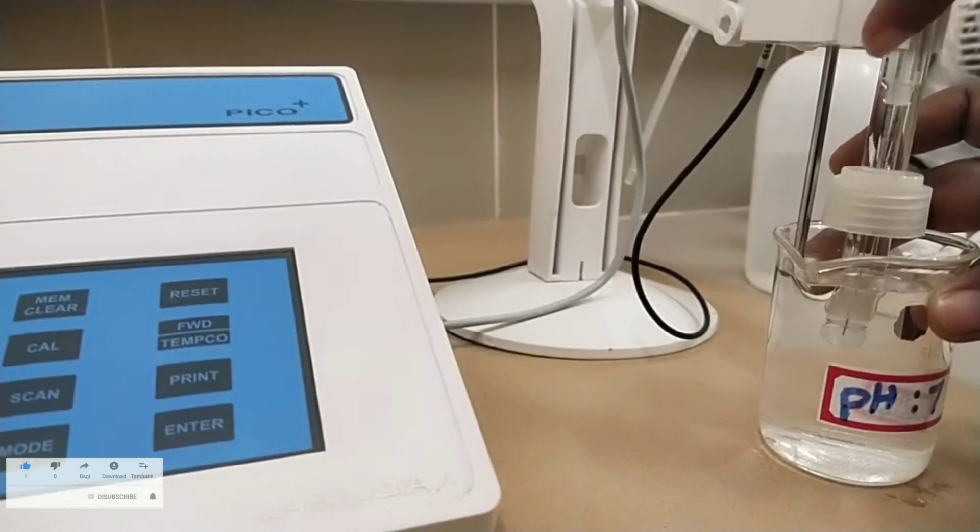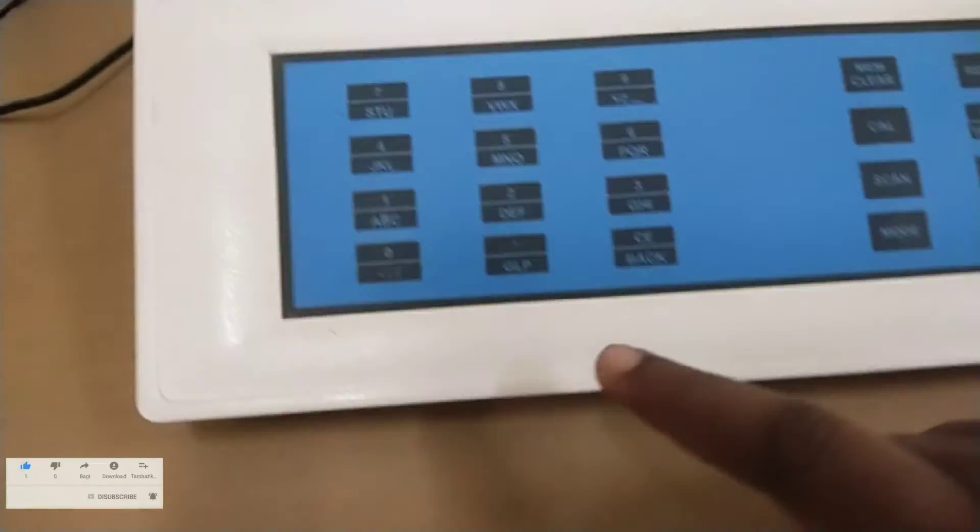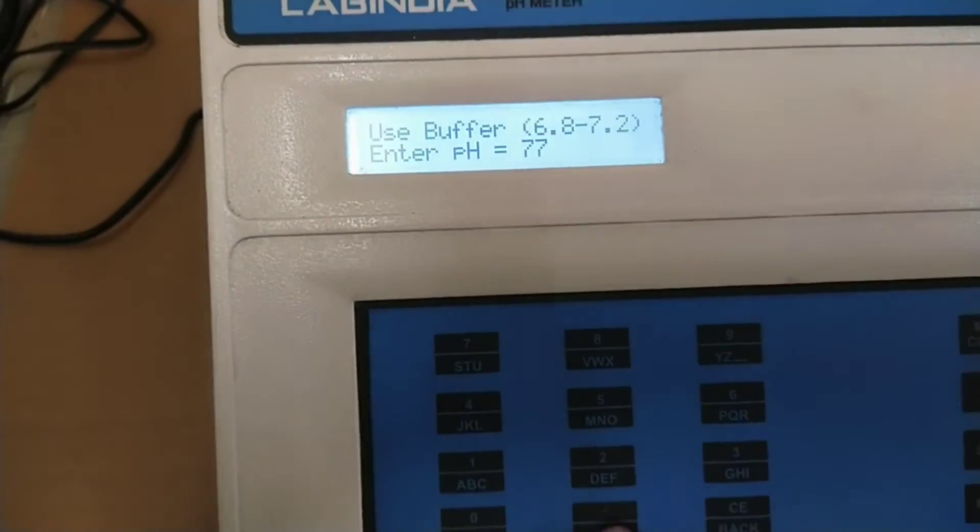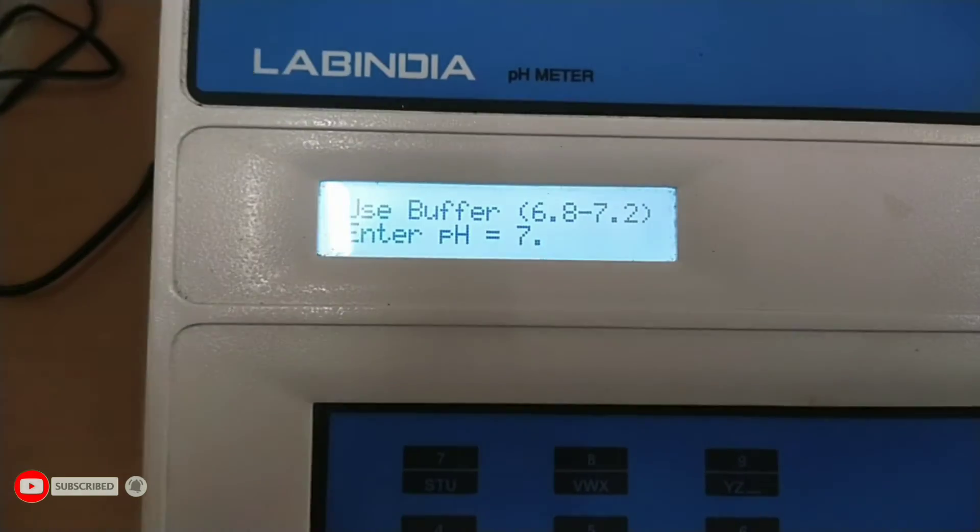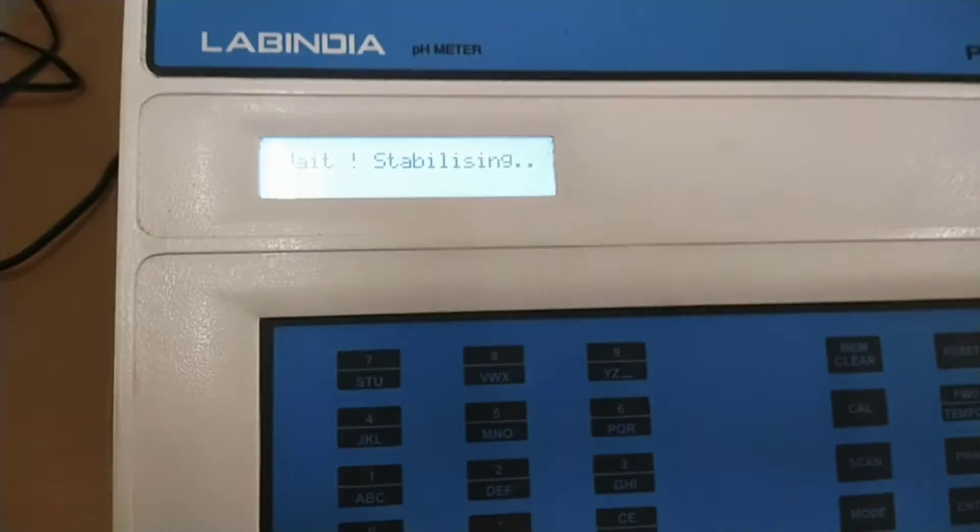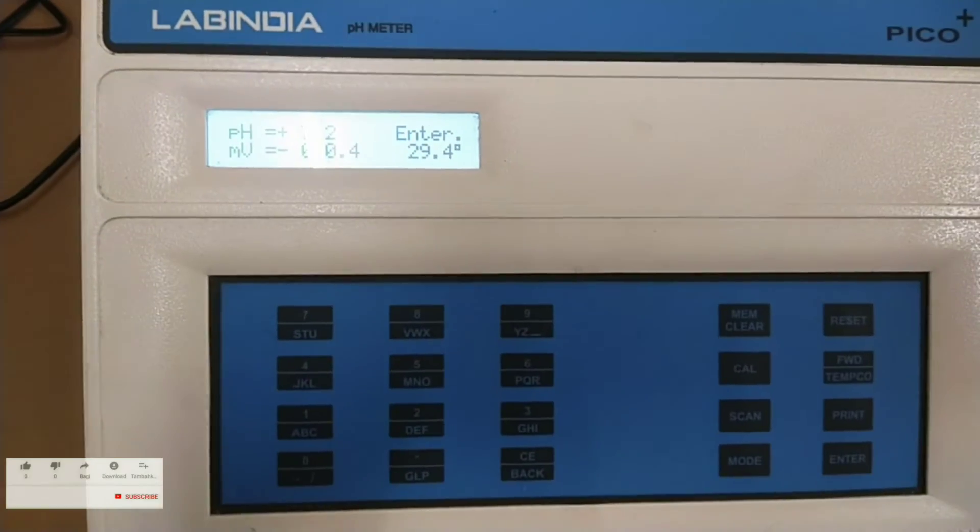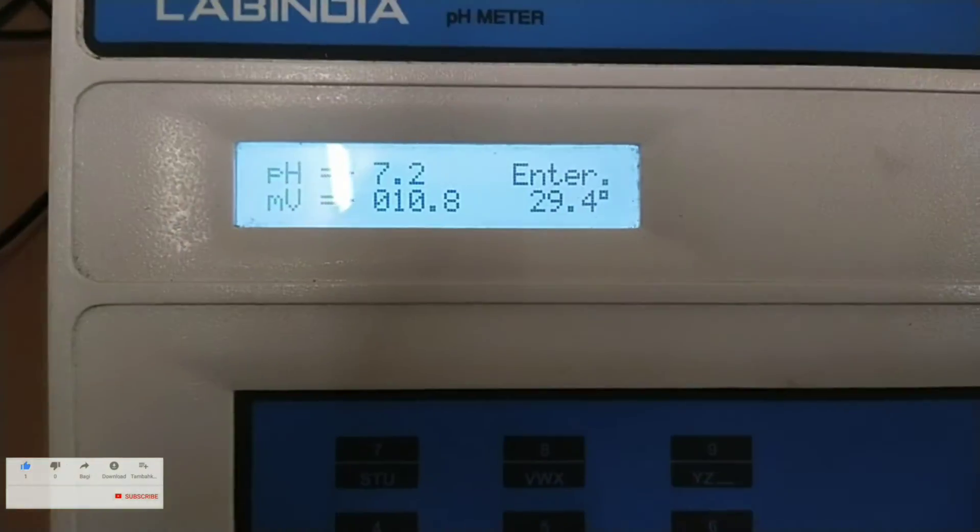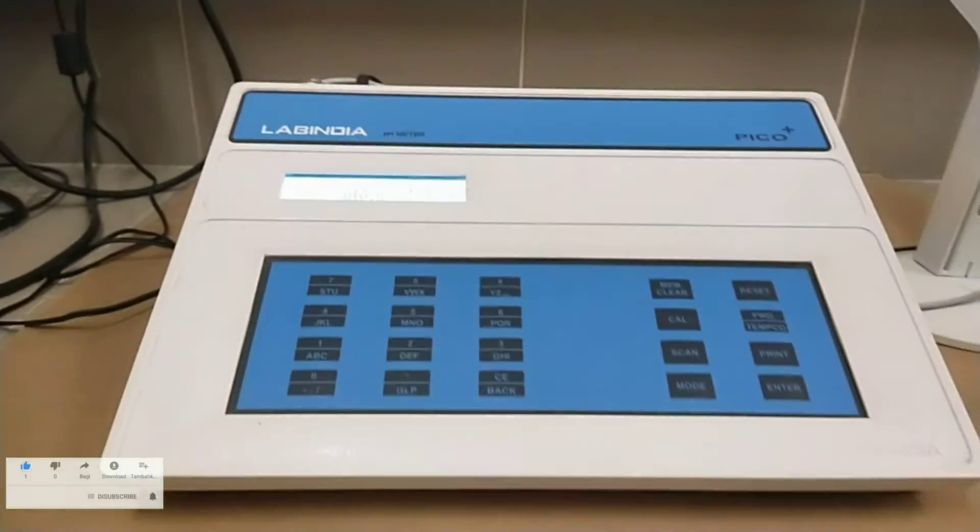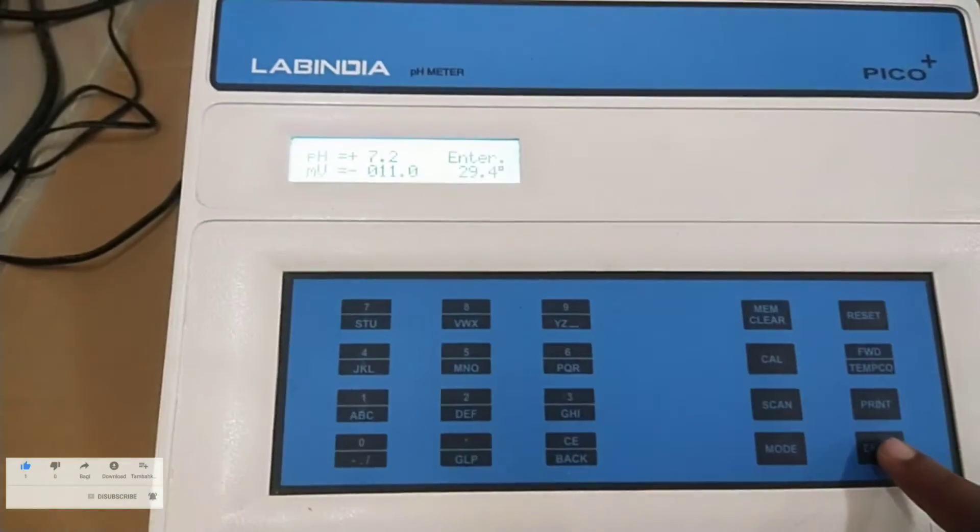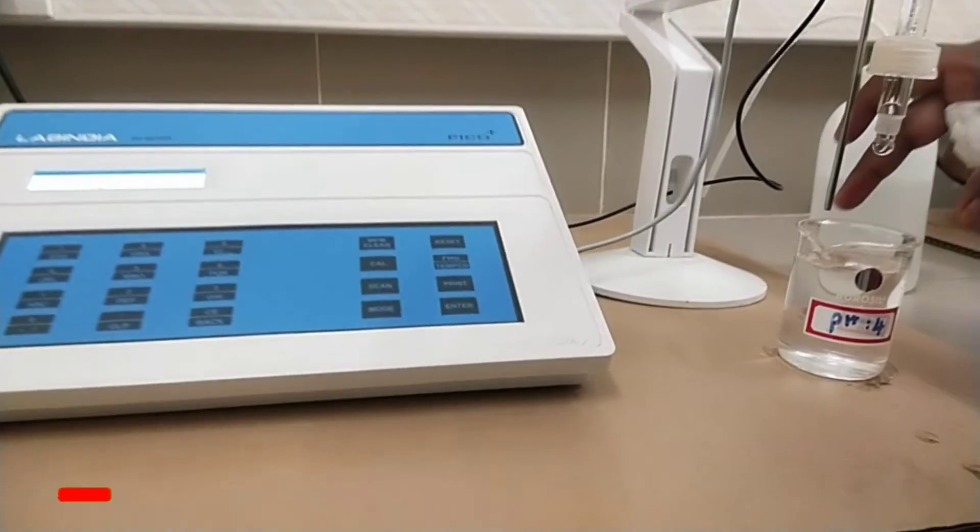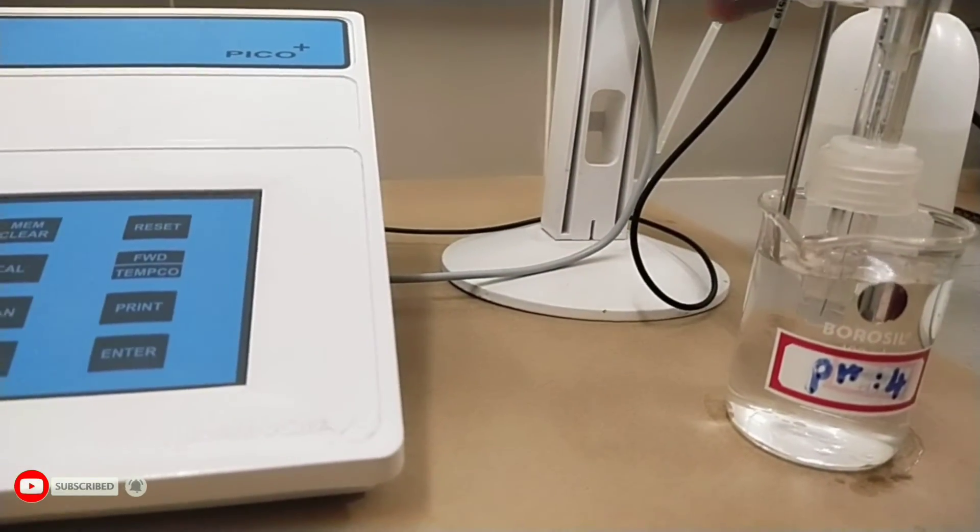Now after cleaning the pH electrode insert the pH electrode in pH 7 solution buffer. Enter the value pH 7.00. Now press enter key. It displays reading. Again remove the pH electrode from pH 7 buffer solution and rinse the pH electrode with distilled water. Remove the excess water by soaking it with tissue paper. Here the instrument provides option for the user to start either with acidic buffer or basic buffer.